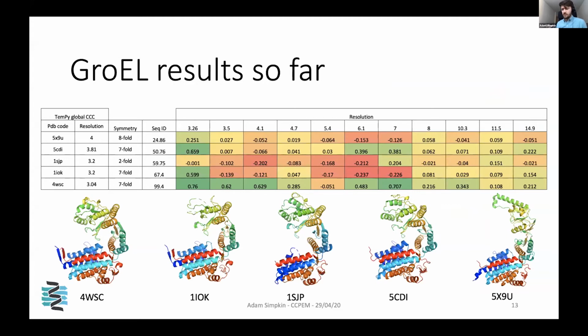This works well with the MrBUMP style of searching lots and lots of different structures at once, because there might be something that has that conformation but is sequentially less similar that can be caught in this way. This can be shown a little bit more obviously if we just focus on this 7 angstrom map.